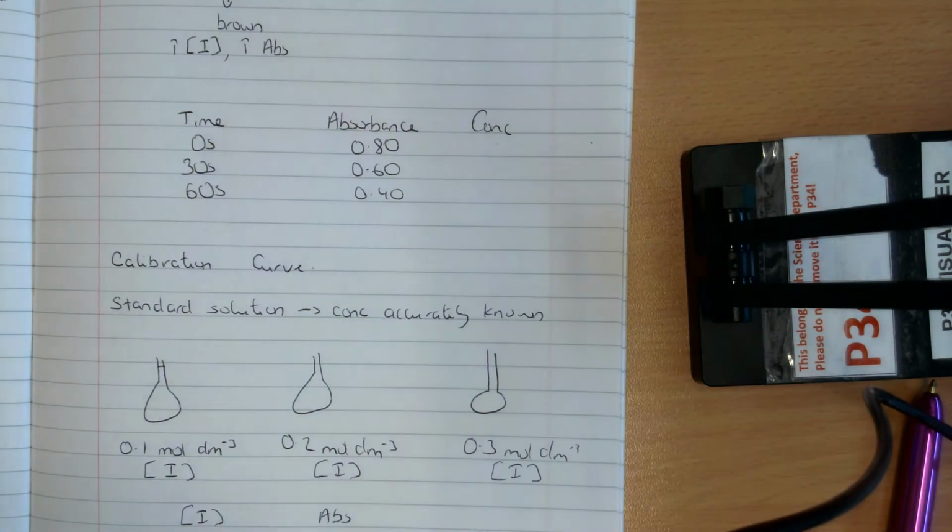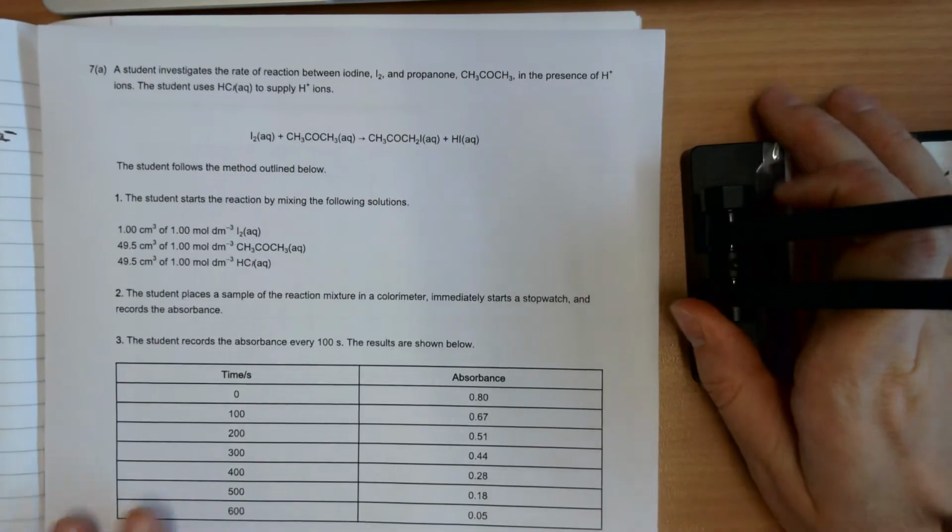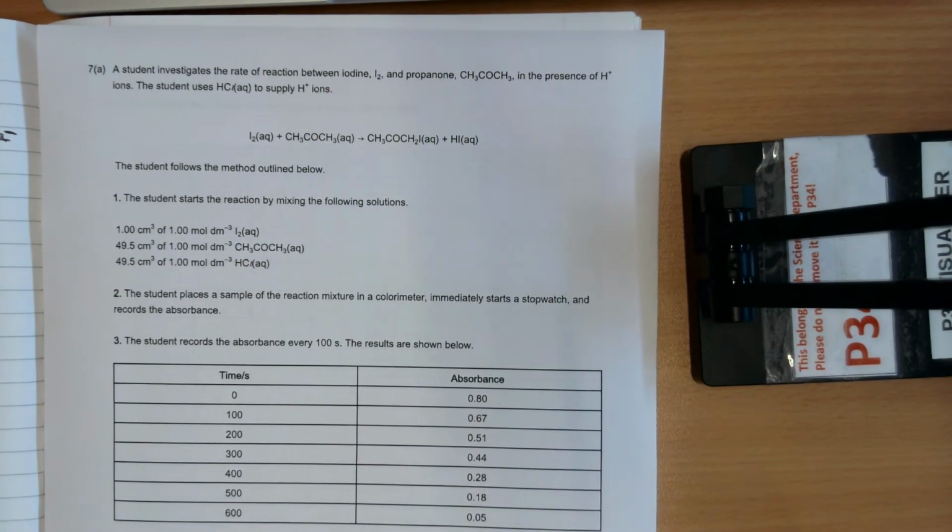Typically, they don't ask you about the colorimeter itself. You're not going to be asked to explain how it works in terms of the filters and the absorbing of light. They're typically going to give you some data, and they're going to ask you maybe to plot a graph and then to interpret that graph.